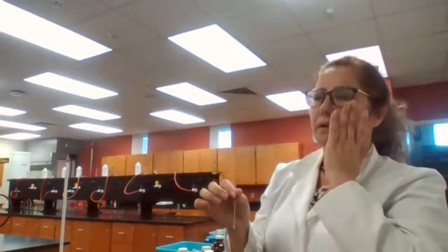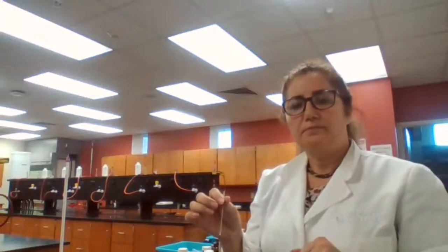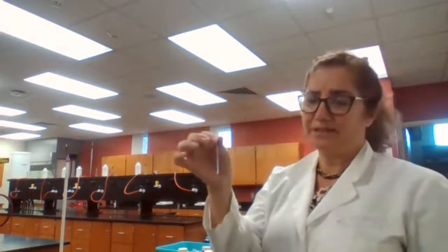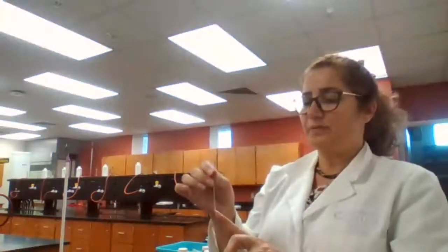So what is the application of melting point? Why do we measure the melting point for any compound in the lab? Can anyone answer that? What is the application for melting point? Purity, perfect. We can determine the sample is pure or not if we measure the melting point. A pure sample is going to melt with a sharp range of melting. Very good. Purity and identity. So a pure sample is going to melt sharply.